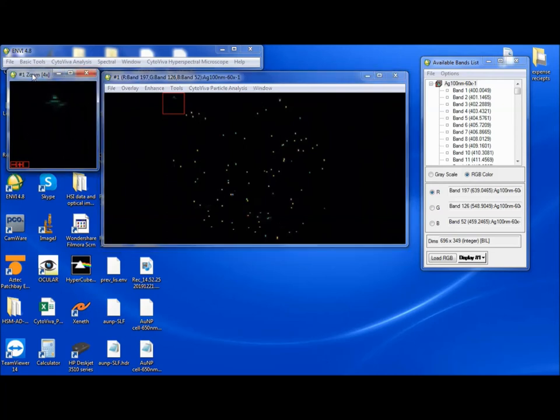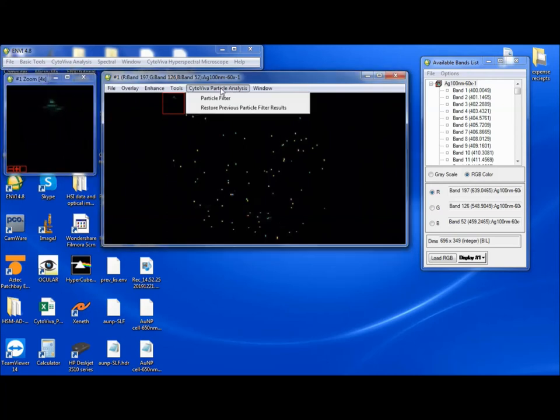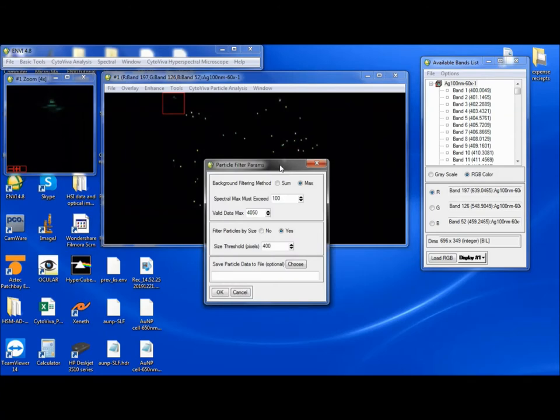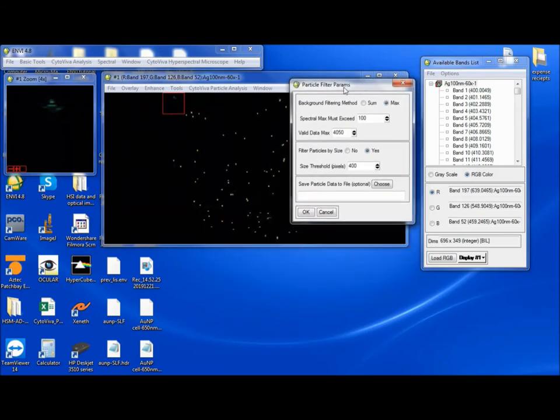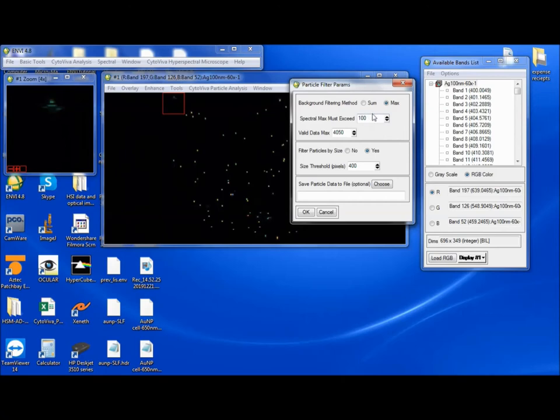So to use the Cytaviva Particle Analysis Tool, it's called Particle Filter, that's the name of the tool itself. We open it, and these are the parameters. The background filtering method is sum or max. We always want to keep this at max. The spectral max must exceed, and this is where you would put a threshold for how intense the scatter off the particle must be for it to be counted as a particle. Obviously, you don't want to have this too low, and it will get background noise or maybe particles that aren't what you're looking for, such as maybe dust or scratches or something on the glass.